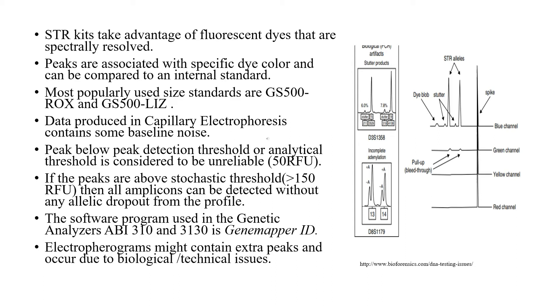The software program for analysis in CE instruments AB 310 and 3130 is GeneMapper ID. Electrophoreograms might contain peaks other than the target alleles, and these peaks can be due to technical or biological issues. The analyst identifies these peaks and edits them out of the genotype to prevent incorrect analysis of data.